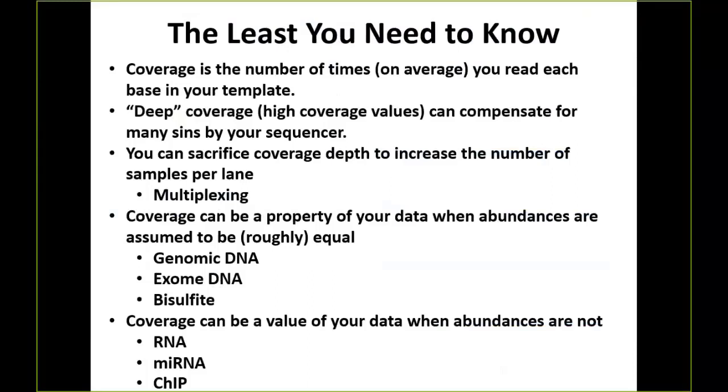All right, so what's the least you need to know here? Coverage is the number of times on average that you read each base in your template. It also describes how much sequence count you're going to want, especially for RNA-seq.